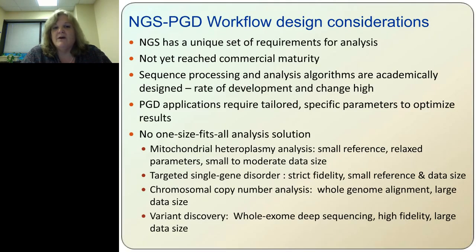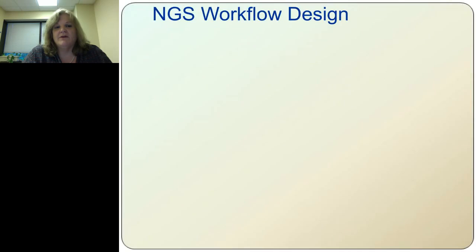So all those requirements are different settings in your software that, if you use these as a laboratory test, you're going to have to record. They're all going to be different parameters, all recorded separately and differently for each method that you use. So it's almost like you have a different assay or a different platform, even though you're using the same platform, NGS. The software and the requirements in that entire pipeline can be completely different between two applications. So it's no one size fits all, and please keep that in mind if you're designing your workflows.